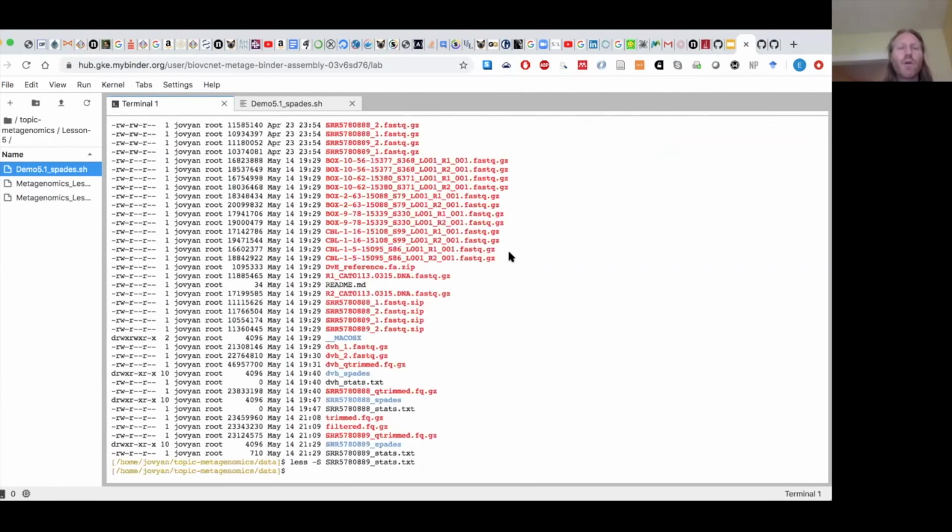Like I said before, one of the techniques we often use is to just run a bunch of assembly pipelines with different parameters and then compare the outputs and pick the best one for going into our downstream analysis pipeline. And that's a very valid way to do this at the moment because there are no real gold standards for a lot of these things, especially in metagenomics. So there's still a lot of exploration to be done.